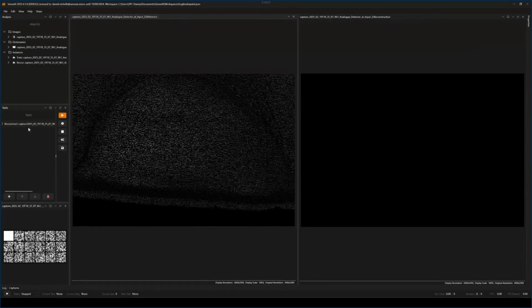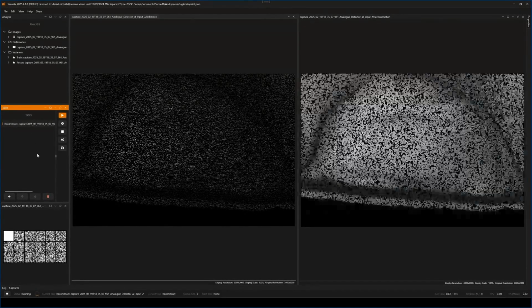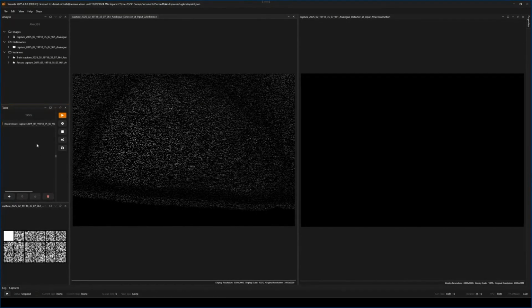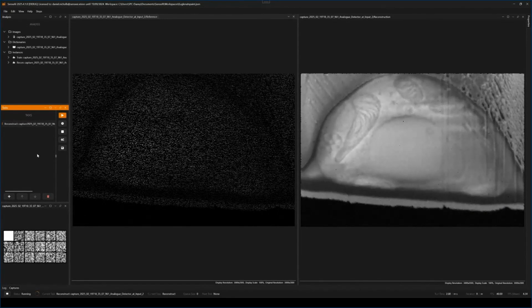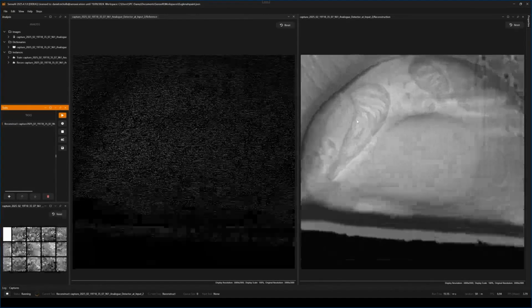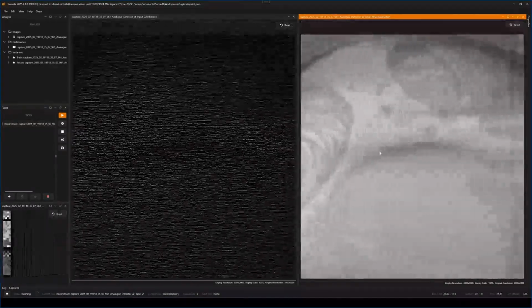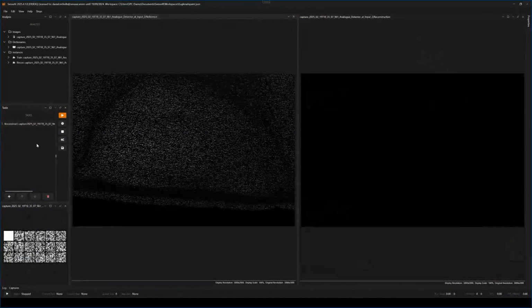These methods aren't only applicable for the imaging of periodic crystalline materials, however, and shown here is an application of SenseAI to an image of an algal cell produced by cryo-FIB-SEM, and was imaged using only 12.5% of the pixels of the equivalent full-frame image. Despite containing no periodic structures, the reconstruction is successful. This is because the dictionary learning algorithm doesn't learn periodicity, but spatial redundancy. In this case, the sample is sufficiently spatially redundant to allow for those key spatial features to be learned easily.